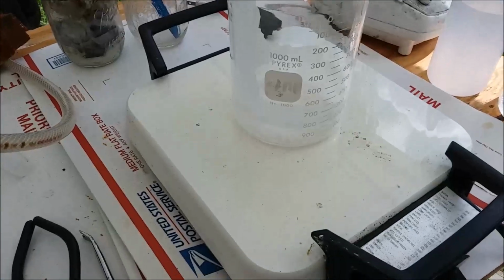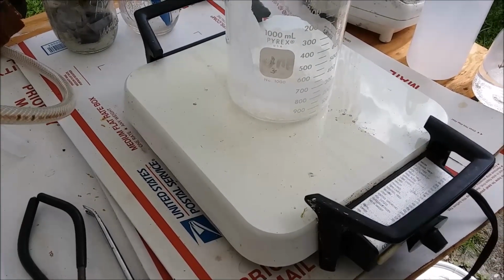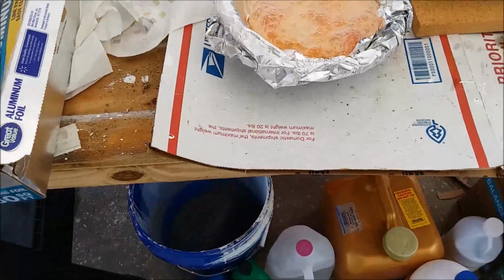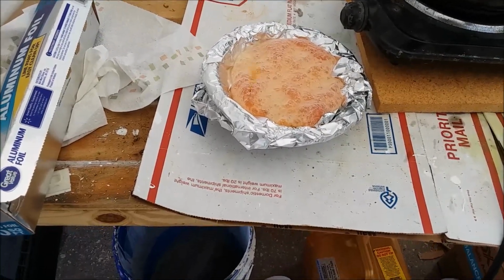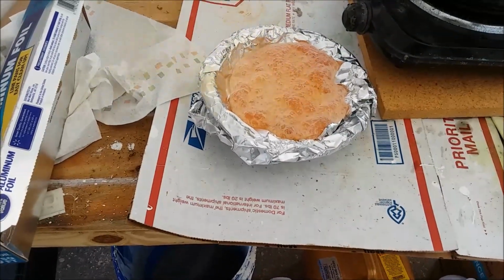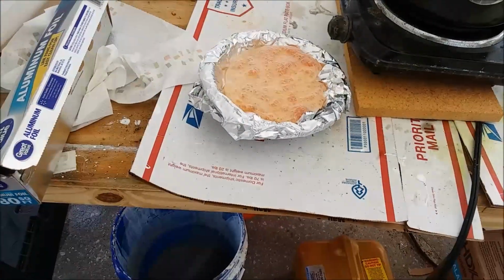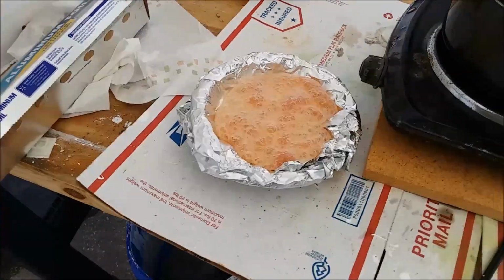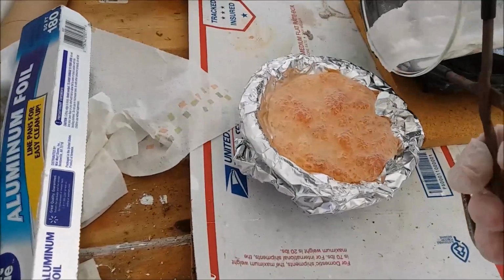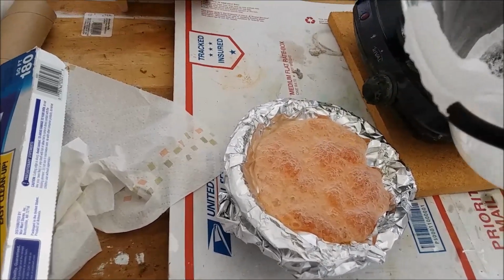So I dumped it into this beaker over here. I've got the beaker on the heat right now to keep the sodium bisulfate semi-liquid, so I can pour it out of the beaker. I've already poured some out, poured it over here into this, basically just a paper bowl covered with aluminum foil. And I think the aluminum foil is being attacked by the hot mixture, because there's a lot of nitrogen dioxide coming out of it, but I had to do something with it. Let me see if I can dump off any more here. I'm sure it'll harden very quickly. This isn't coming out.